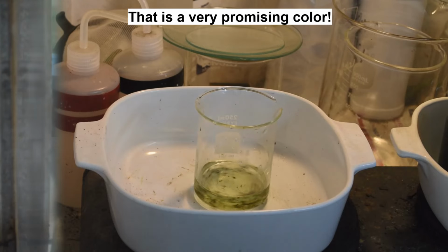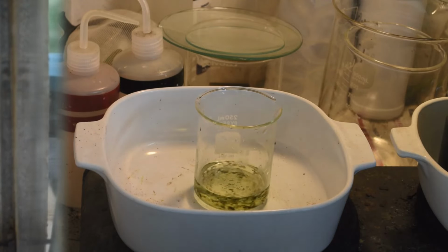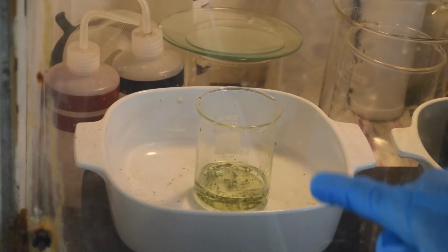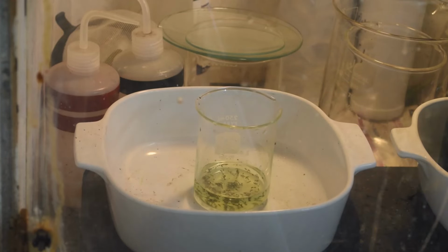Put a little heat to it. Lid this stuff up. We'll let that stuff cook for a little while and do a stannous chloride test on it and see if there's any palladium there.